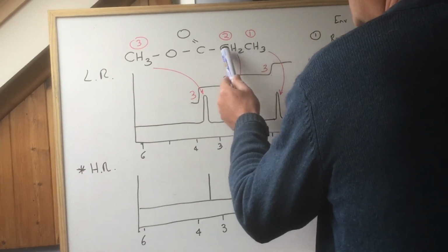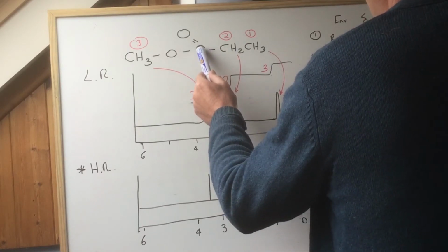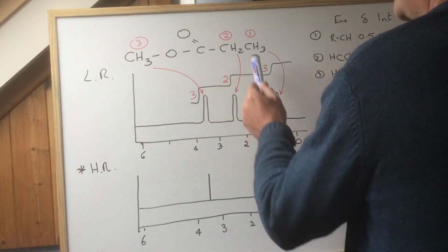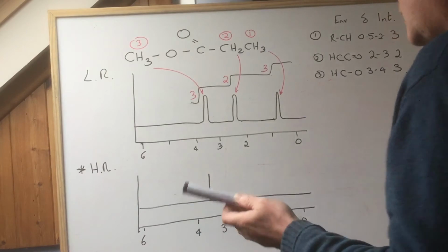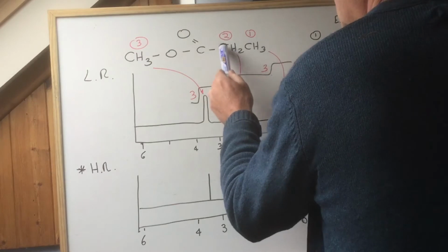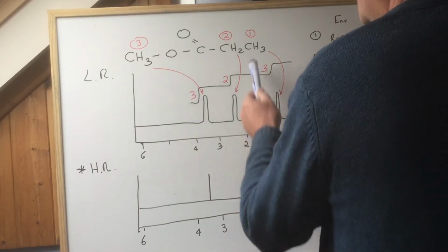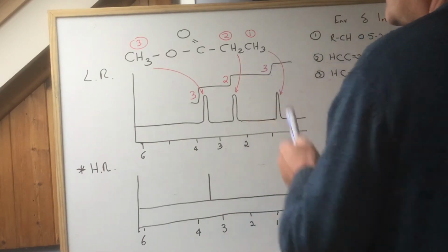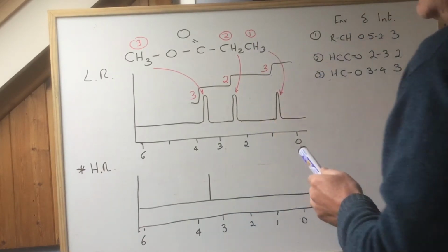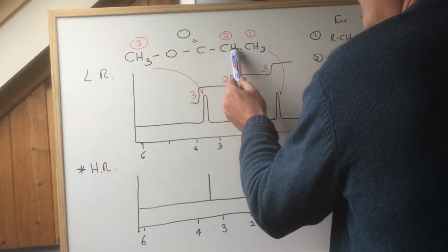Do those adjacent carbons have protons on them? That one doesn't, fortunately, so it can get a bit complicated. That one does. And how many are on that adjacent carbon? The one we're looking at is this peak here. We need to determine how much it's going to be split. Yes, there's an adjacent carbon with protons on it. So n is 3. There are 3 protons on the adjacent carbon to the one we're looking at.